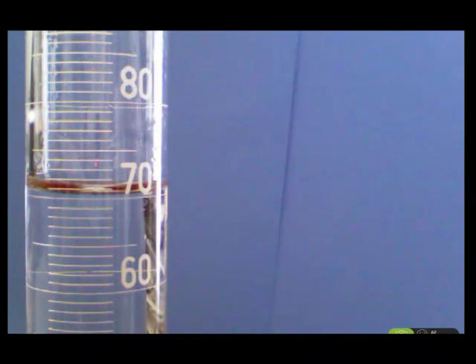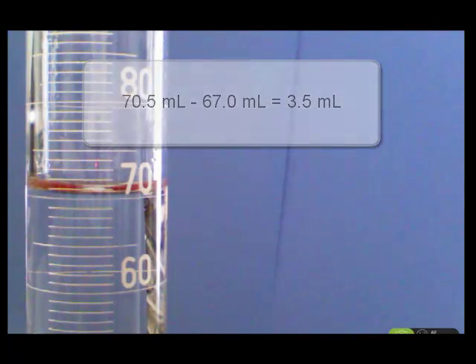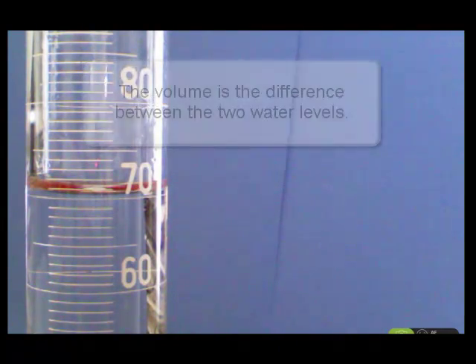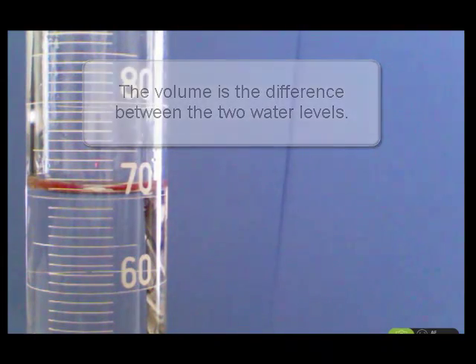Well, we're going to take the 67.0 and subtract that from 70.5. So 70.5 minus 67.0. So the volume of the bolt is 3.5 milliliters. So it's the difference between the two water levels. And that is how you do volume by water displacement.